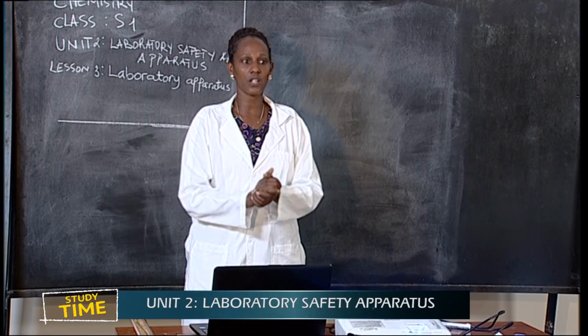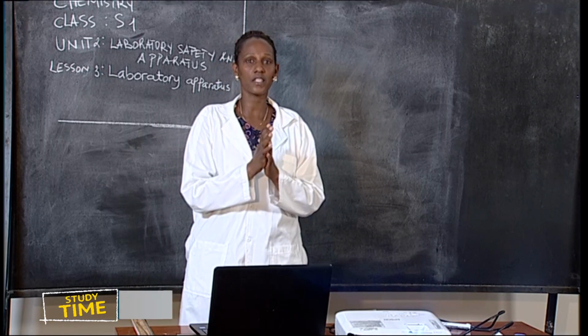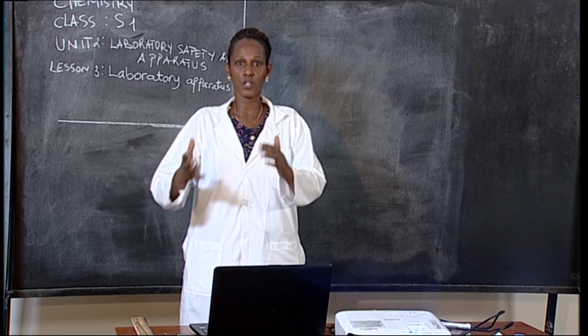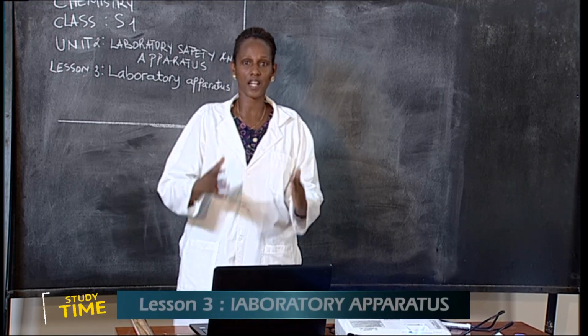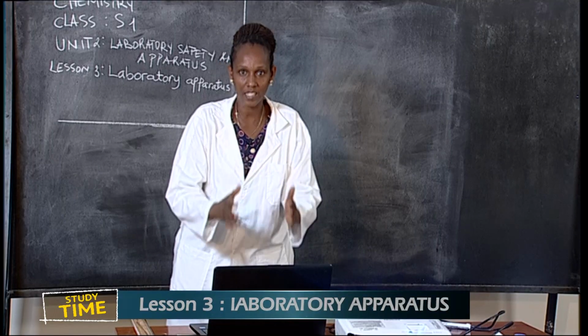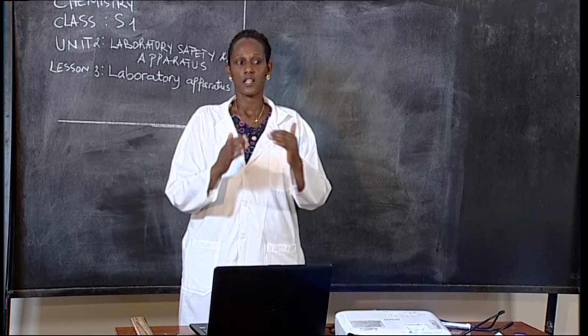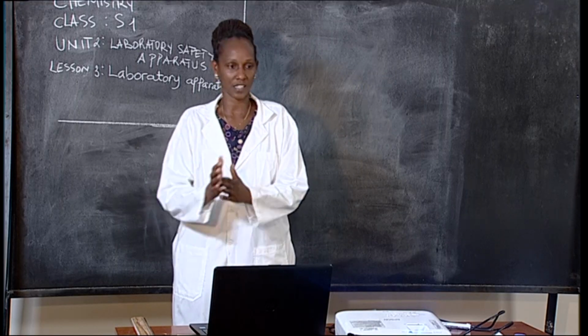So today we're going to look at the laboratory apparatus. The other time we were looking at how you behave when you're in a laboratory, the rules and the regulations in the laboratory. Now today we are looking at the apparatuses in the laboratory. That is lesson 3, laboratory apparatuses.